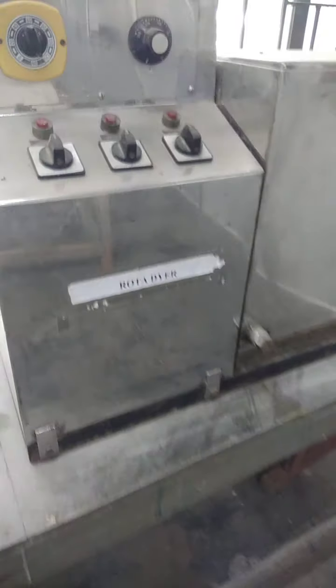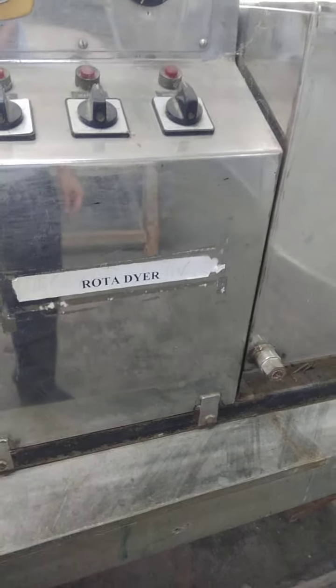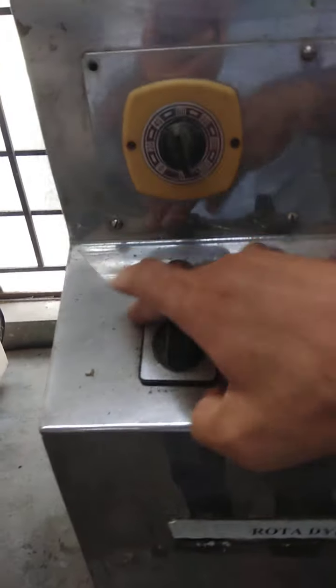There is also a rota dyer machine. In the rota dyer we put various samples in beakers, set those beakers in a rotating frame inside the machine using stainless steel beakers, and rotate them. Controls include a main control, timer, motor on, and heater on. We can set the time and control the temperature. This is a rota dyer machine used for multiple sample dyeing in the lab.